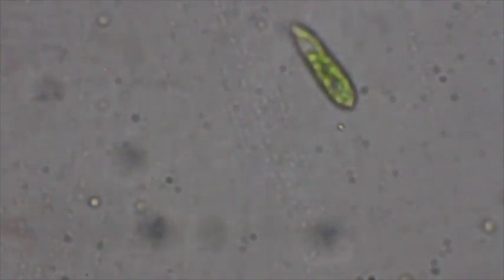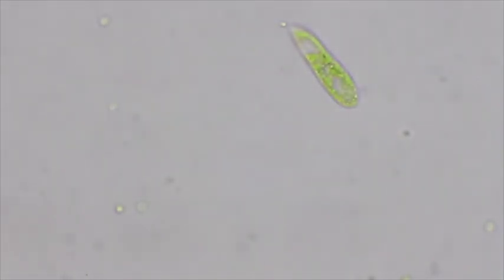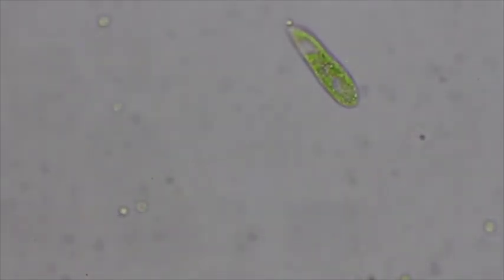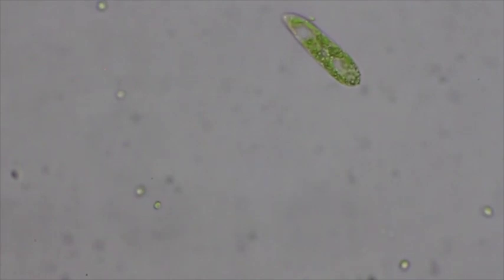I'll increase our magnification to 40X and go ahead and focus again. You can see how it's nice and green — you can see all those chloroplasts inside. This one is not moving too much, which is good. We'll increase the light a little bit to try to increase the resolution so we can see it better. These guys are pretty small; a lot of the protozoans you'll be looking at today are going to be a little bit bigger.